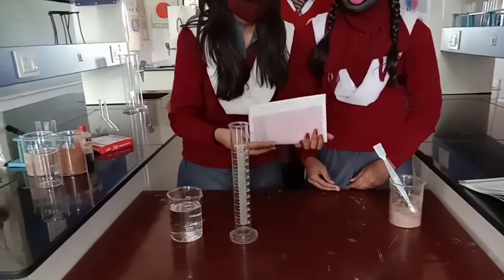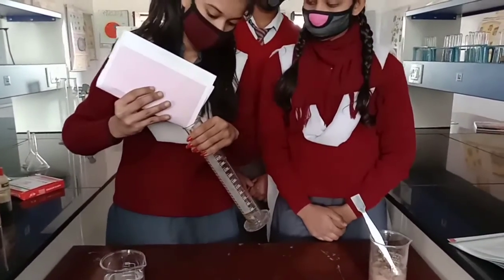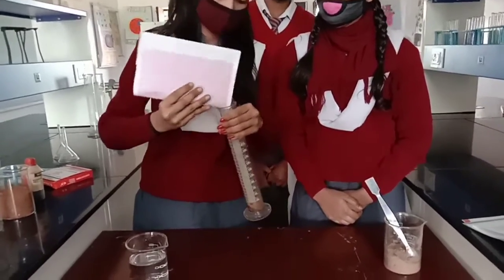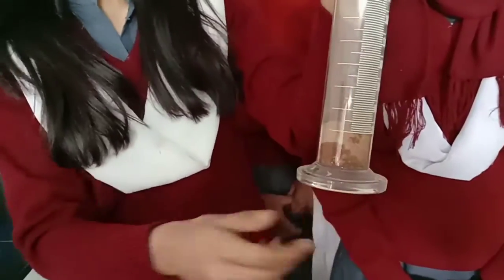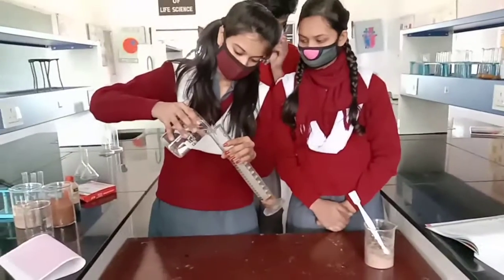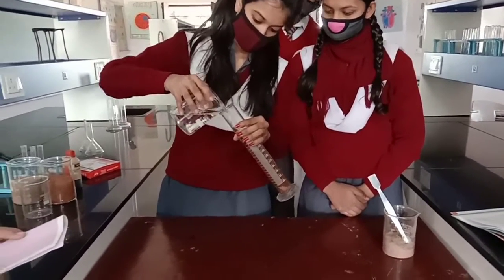After that, we'll pour this amount of our soil sample into this measuring cylinder. We have put the soil sample inside this measuring cylinder like this, you can see here. After that we'll pour some water, about 200 milliliters.